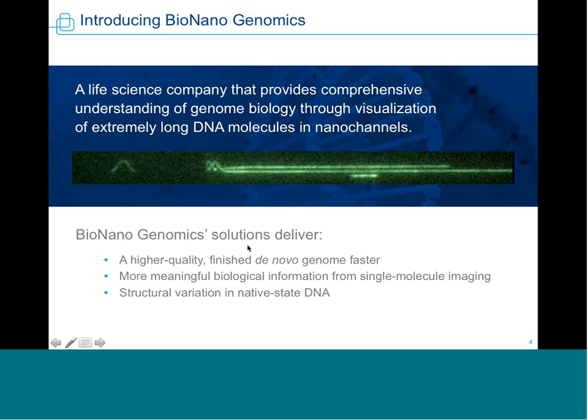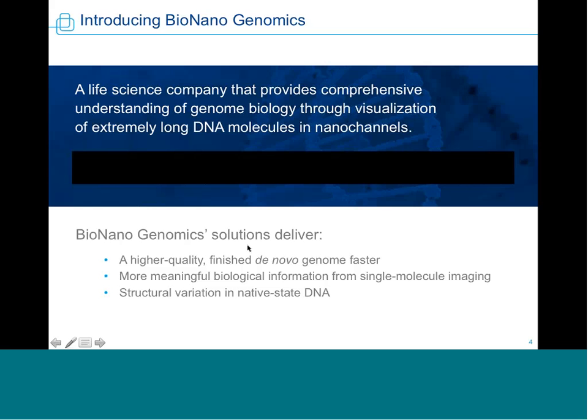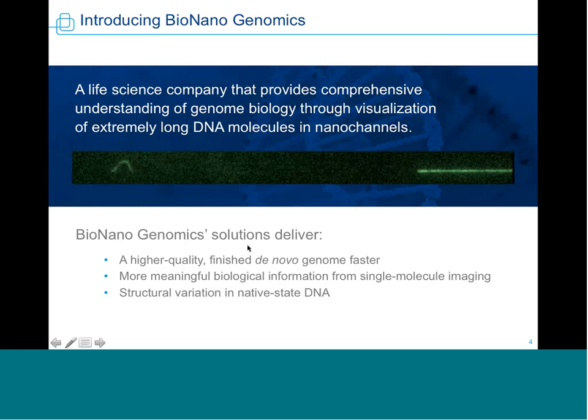You see a key up here of 75 kb, so you can see these molecules are on average a couple of hundred kb long. The DNA molecules unwind through these pillars and are delivered into nanochannels where they're fully stretched. That's the core concept behind BioNano, is direct imaging and linearization of molecules.